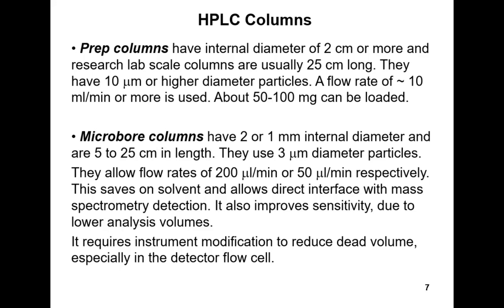You can get even bigger ones in industrial labs mostly. Can't remember what the biggest one I've come across is. You can get them that are maybe 10 to 20 centimeters diameter inside, and you're getting up to being able to purify gram quantities of material.